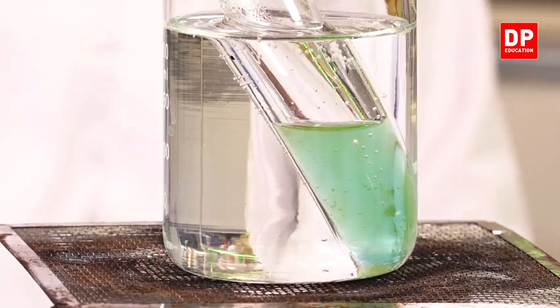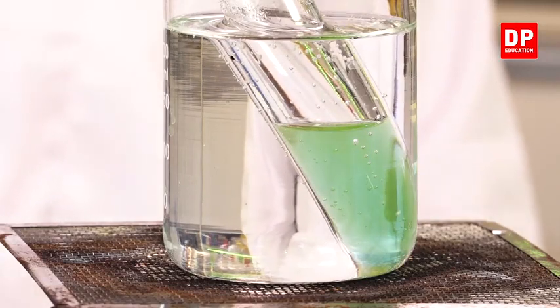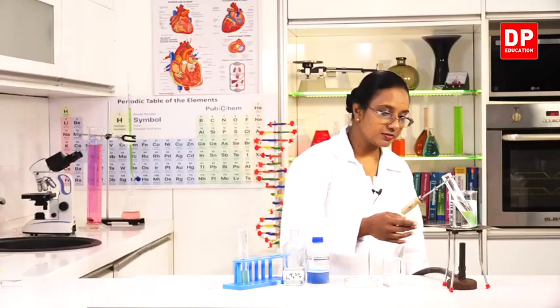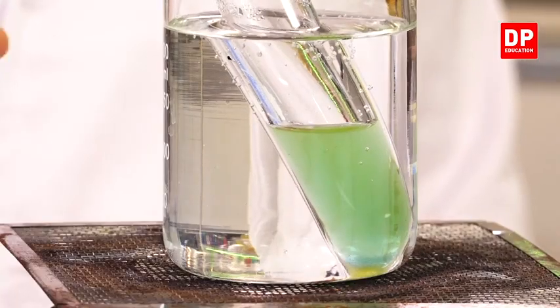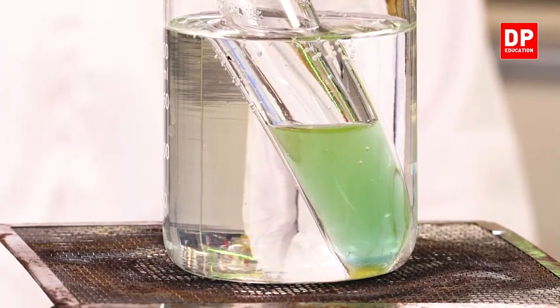Now you can see the solution slightly turning from blue to green color. First it was a blue colored solution. Now it has become a green color solution. The color change will continue.